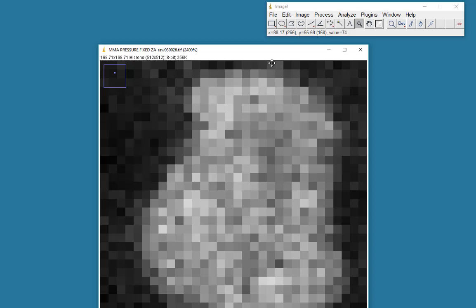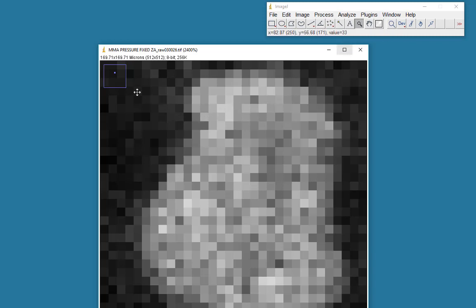If you look up in the bar up here as I move the mouse, you'll see some numbers up here when I move onto the image. If I go to a very dark area of the image, you'll see I get a low value of 20. If I move to a very bright pixel, you'll see I get a value of 213.